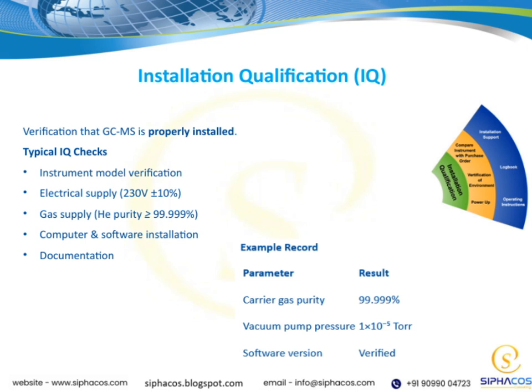Finally, all these checks are documented thoroughly. Proper documentation not only ensures compliance, but also provides a record for future reference and troubleshooting. By completing these IQ checks, we're setting a solid foundation for the instrument's performance and overall reliability, which ties directly into our goal of maintaining high standards throughout the analytical process.